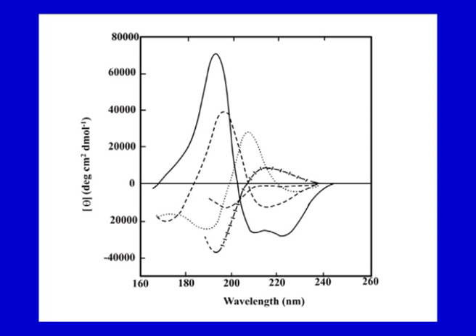So, this is for alpha helix. Then there is this particular one with long dashed lines, which is for beta conformation. Now, if you can see here, there is a negative peak around 218 nanometer and there is a positive peak around a little less than 200 nanometer.